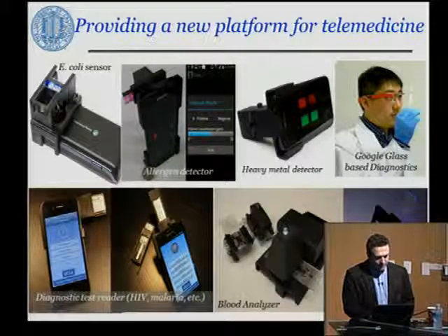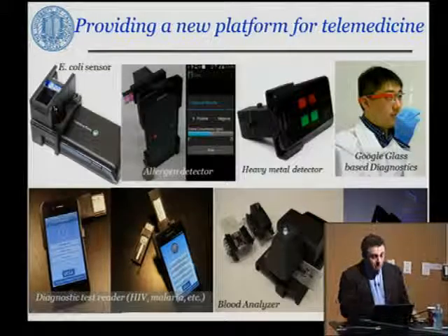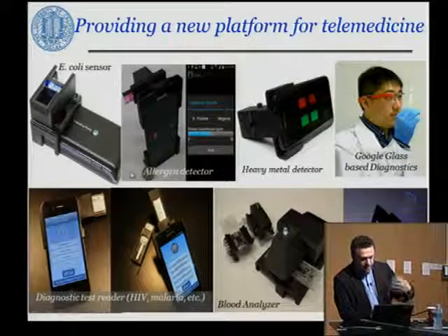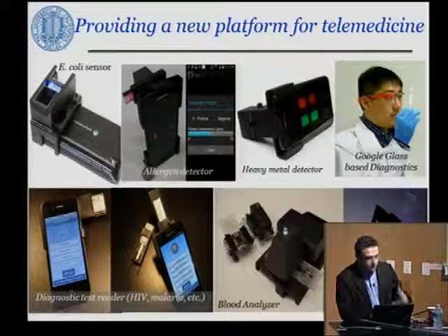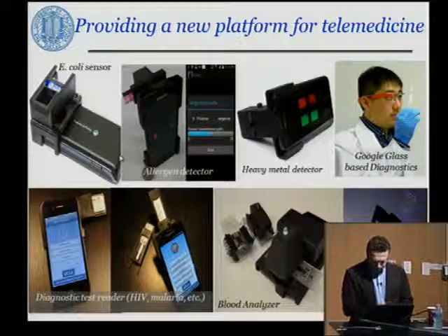It's an earlier generation. Later on, toward the end of my presentation, if I have time, I'll show you some other more recent work for looking at bacteria and waterborne parasites, which also merges machine learning. It's not just imaging, but also some processing done at the back end to give you specificity due to, for example, the shape of the parasite that you're looking at.